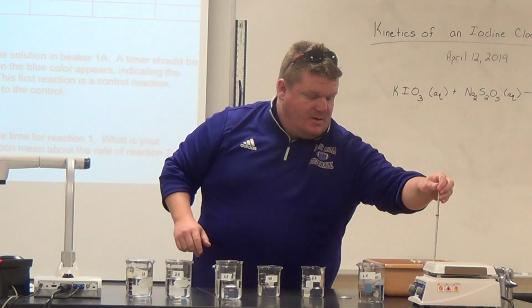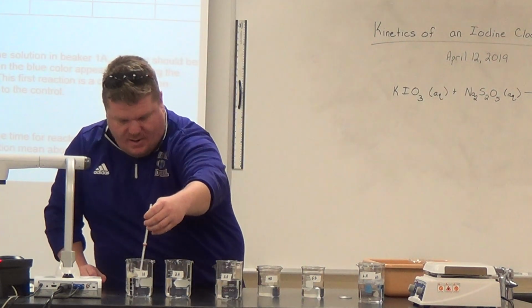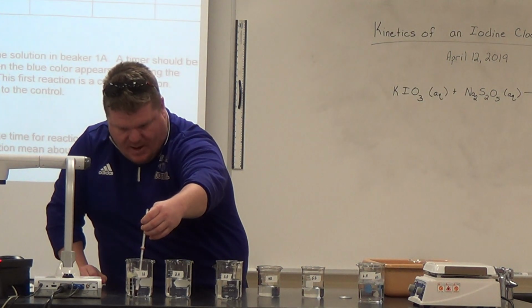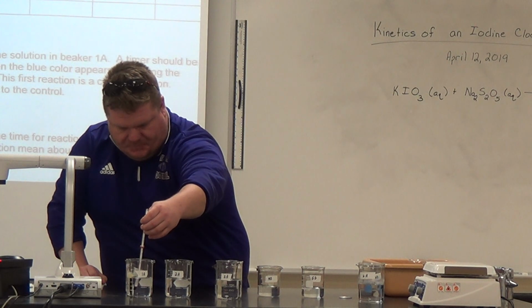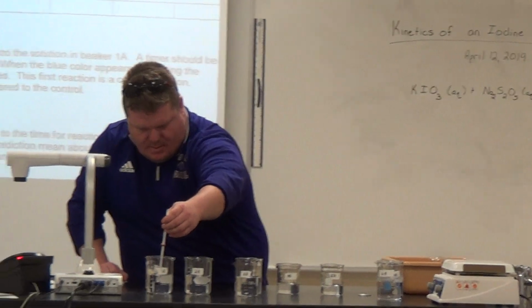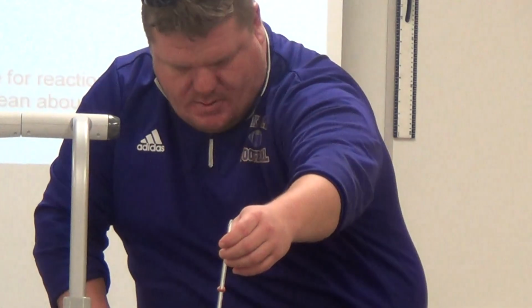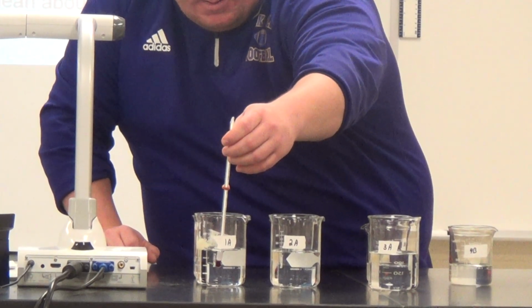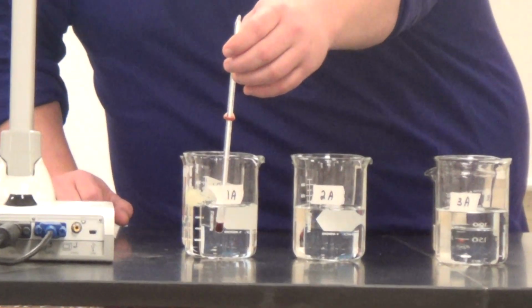All right, we will try this first one out here, but before we do that, we need to take its temperature. So we'll see the temperature here. Give me just a moment. It should be right at room temperature, about 20 degrees Celsius. Looks like it's a little above that, actually. We're getting there, slowing down. We're at 22 degrees Celsius.